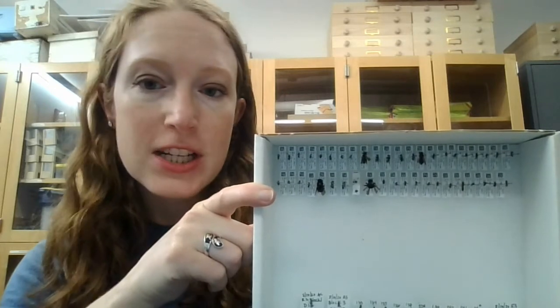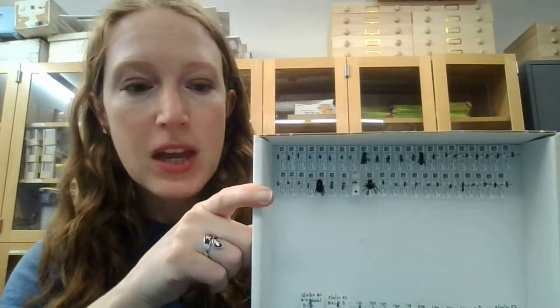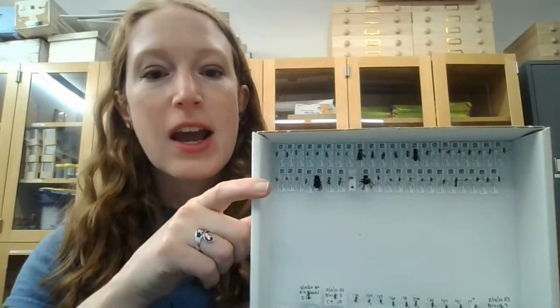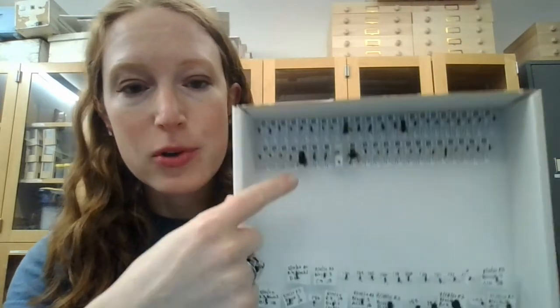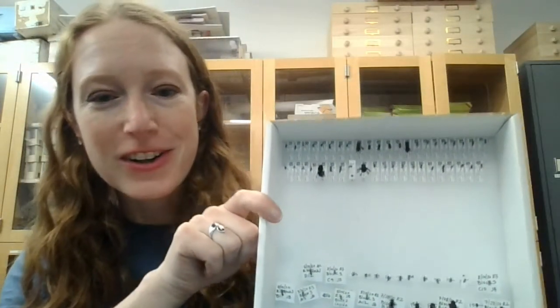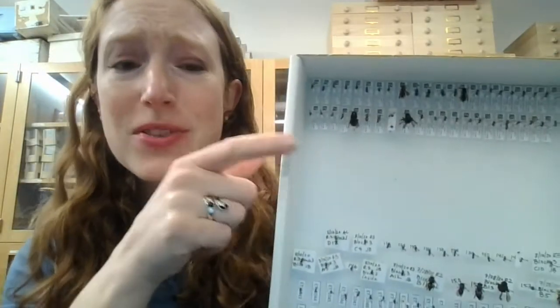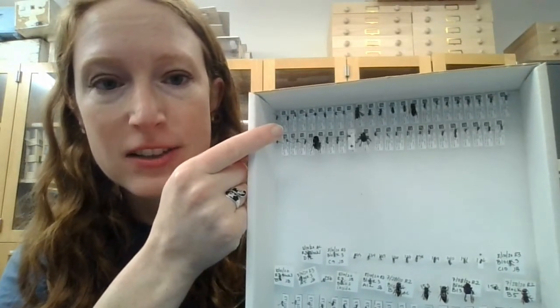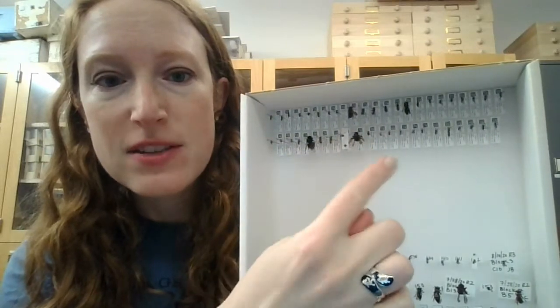So in that spreadsheet, each row is a bee specimen, and they all get a unique identification and a unique barcode. And then we print out these permanent labels, which you can hopefully tell look a lot more professional. At this point, all the bees are still mixed in together. So here are the bees with their final labels.